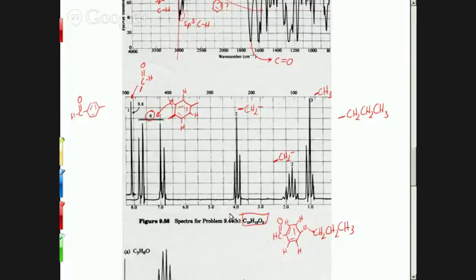All right, now let's do the same idea with your experimental spectrum. You have the structure for your experimental spectrum, right? You know what the structure is supposed to be. From the pre-lab. So what's the product supposed to be? And then work with your partner or whoever and see if you can assign the peaks. So which hydrogens from the structure should correspond to which peaks on the spectrum?